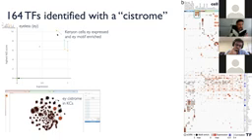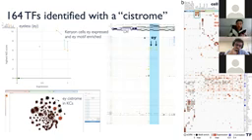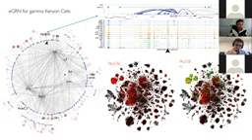identify transcription factors that are important for each cell type, as shown here in this heat map. So in the Kenyon cells, we find Eyeless, Twin of Eyeless, MEF2. And this leads us to the prediction of the key regulators, as well as where they are likely binding. And then, by linking those to the genes, which genes may be regulated. And when we summarize this information, this yields the enhancer gene regulatory network, where the transcription factors are here. They are linked to these blue regions, blue nodes.